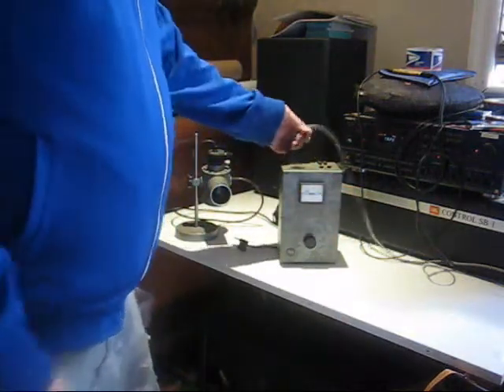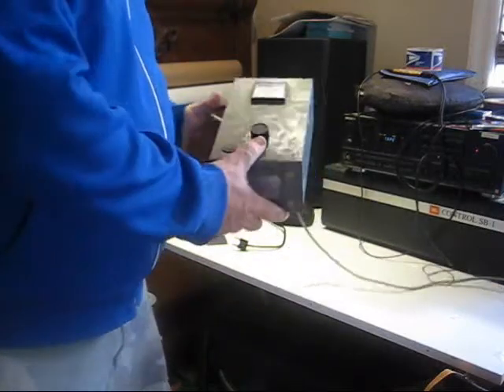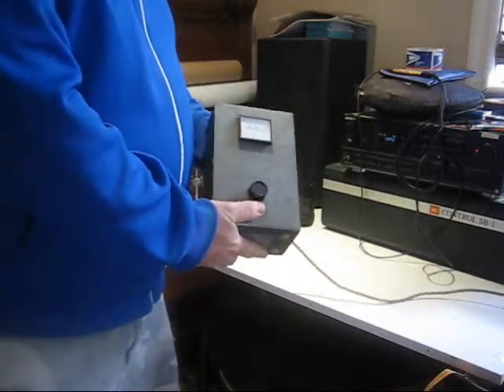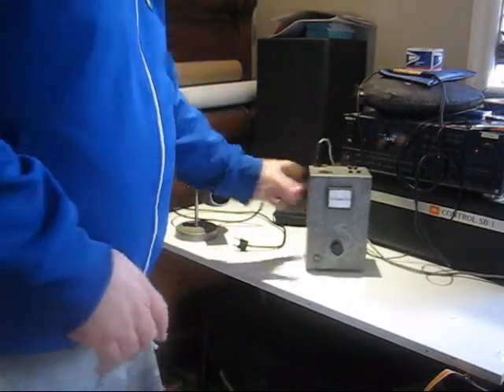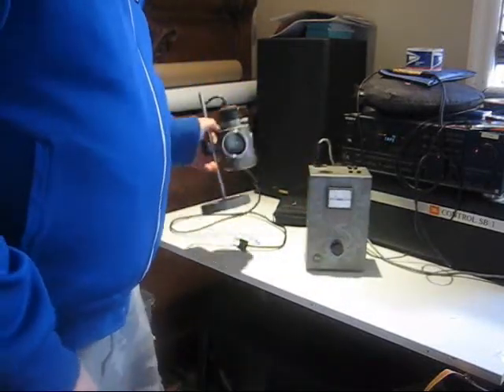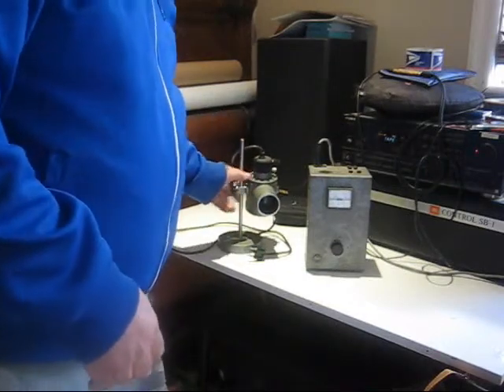Hey guys, this is Tsukimoto. What I've got today is an Ernst lights transformator, and with it is a transmission light source that connects to the transformator — I'll demonstrate it right now.